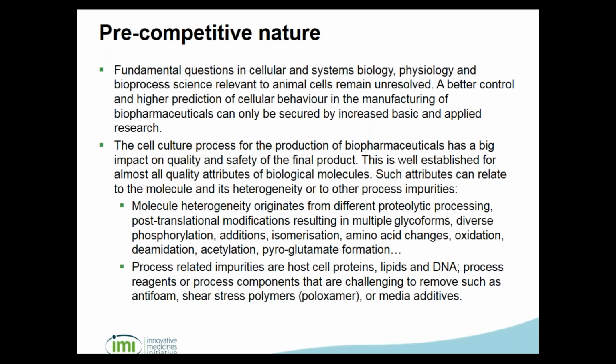So we are looking in how to test this, and then I have to say also to test this as close as possible to the production itself, so that we do not have to run to the lab and then wait for a few hours or even a few days before we get all those answers. So the more we can measure and the more of those critical quality attributes of those proteins we can measure, the more we are in control of our culture.